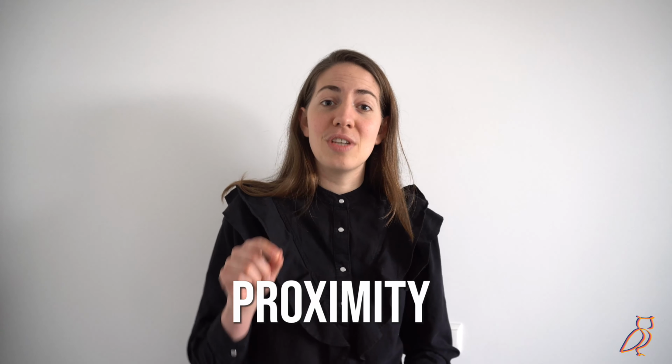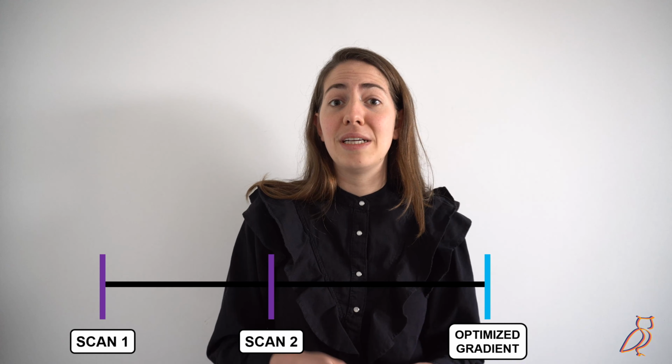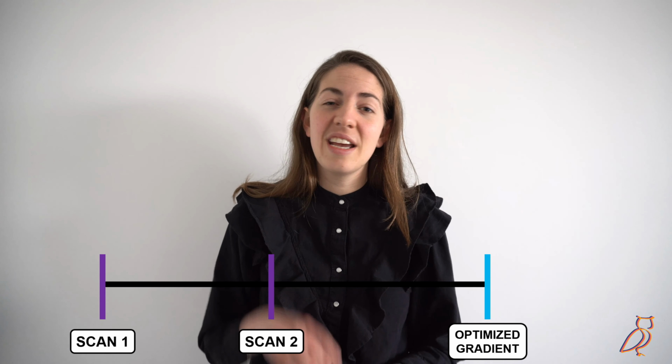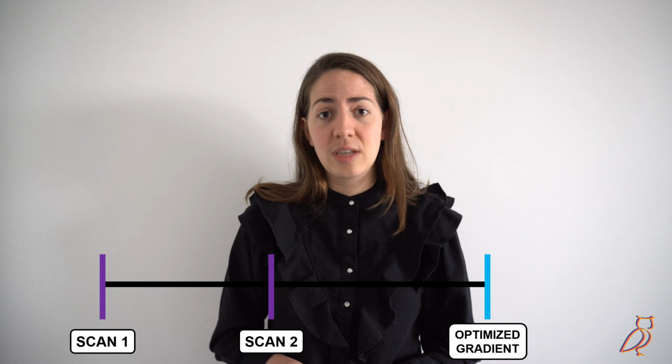How much different these gradients actually have to be was long thought to be a factor of 3. But in one of our recent papers, we found that the proximity of your optimized gradient to your input scans is actually much more important. In that case, if your optimized gradient is further away from your input scans, it could be a good idea to run that optimized gradient again and add that to your input scans.